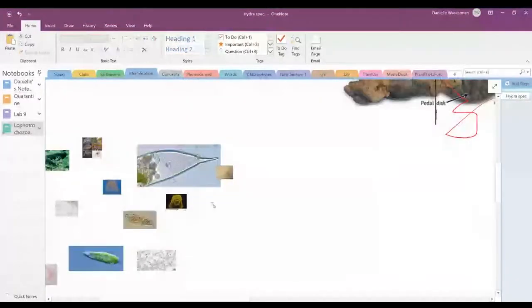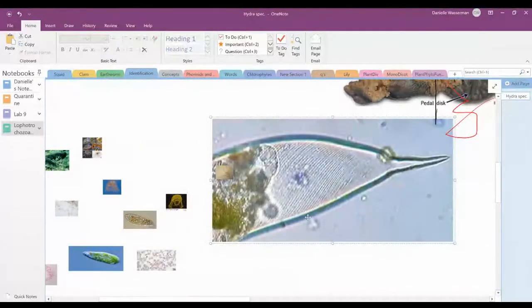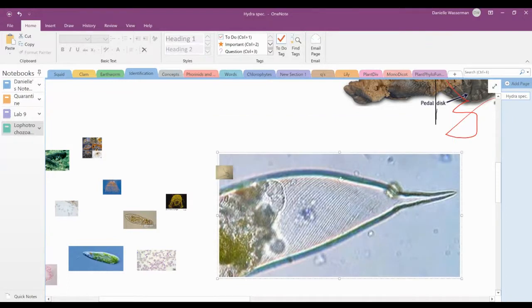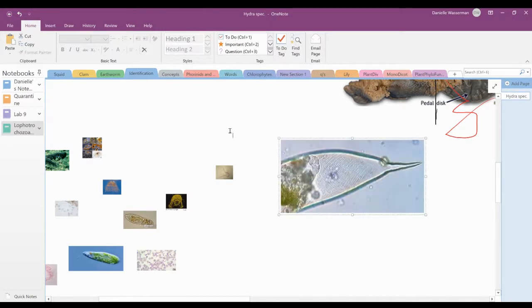So this, I'm starting off with something tough. What is this from? So this is from an organism. Obviously microscopic. The lines are telling. It's one of the shared derived characteristics of this animal. So you won't be asked, what is this animal? That's the kind of thing that I like to do, is show you a part of a thing and say, oh, what is this from? But you could be shown the whole thing and asked, what is this? What is the name of it? It starts with a P. The structure starts with a P. The organism starts with an E.